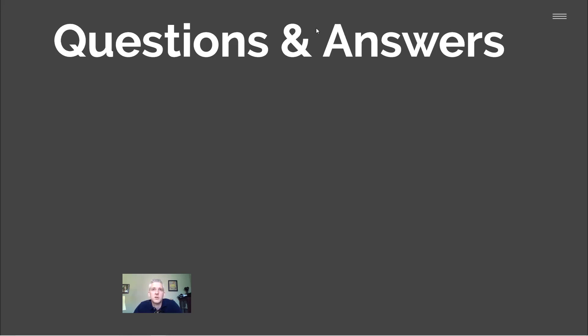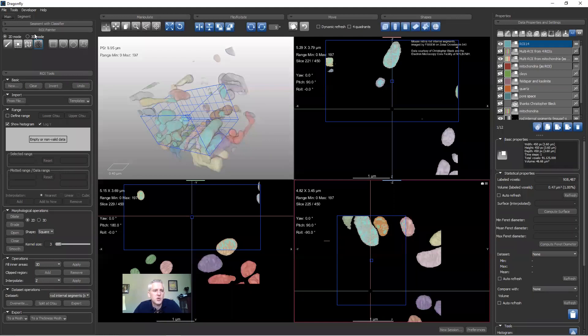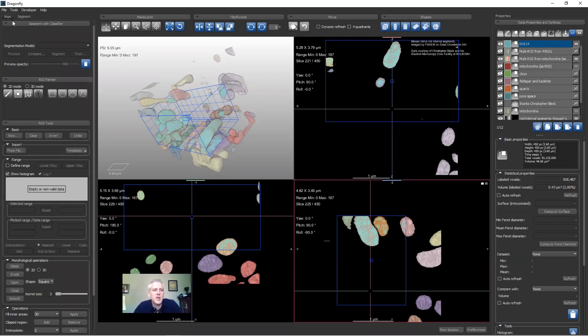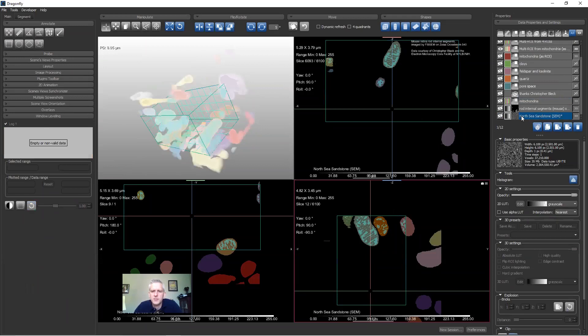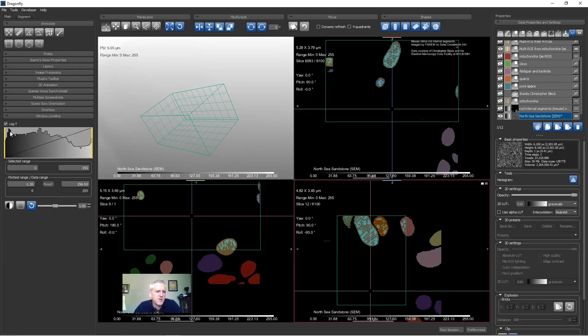Why do you prefer a logarithmic Y-axis on the histogram? Because in images you often have a peak that's much higher than everything else. Looking at the North Sea Sandstone histogram: if I turn off logarithm, you can see the main peaks clearly but lose visibility of the smaller contributions. With log scale you can see all the phases more clearly. It's a preference — you can always turn it off.